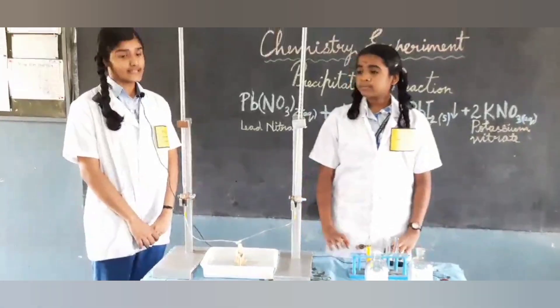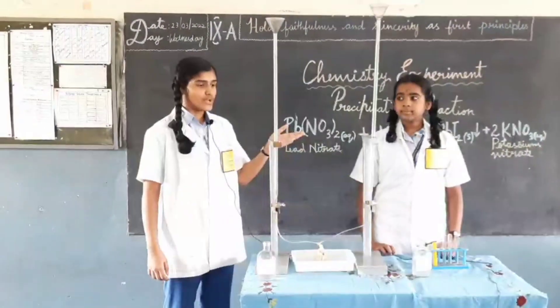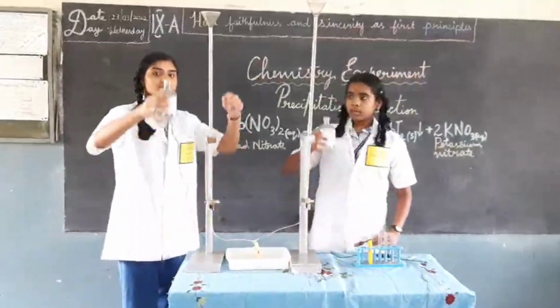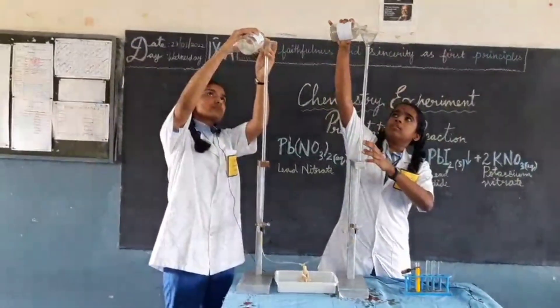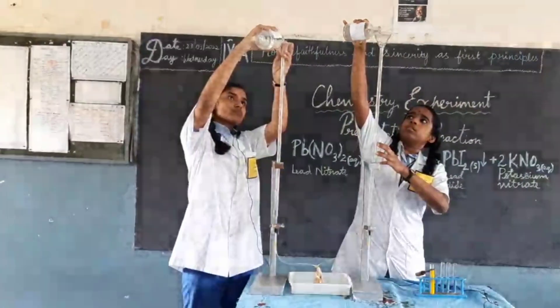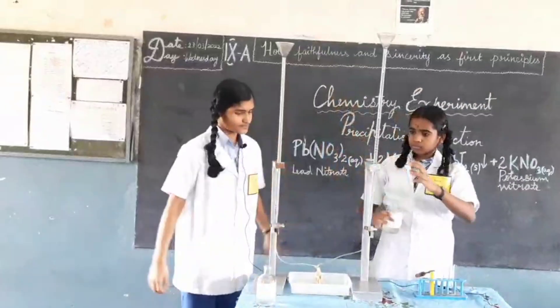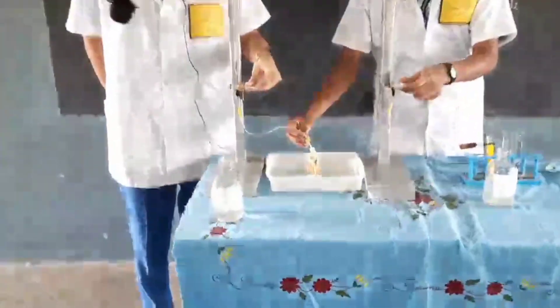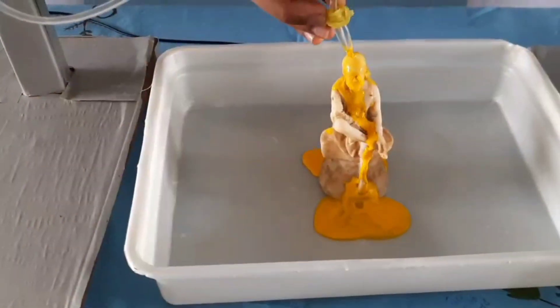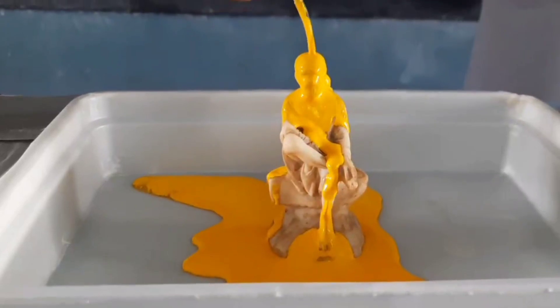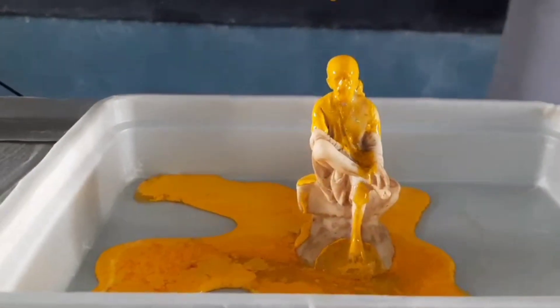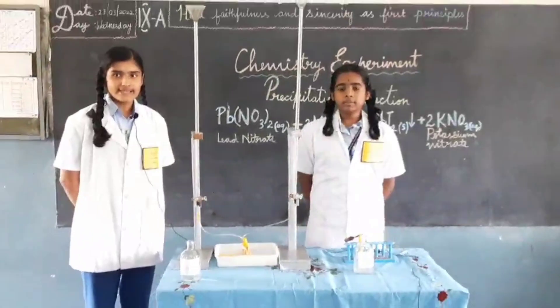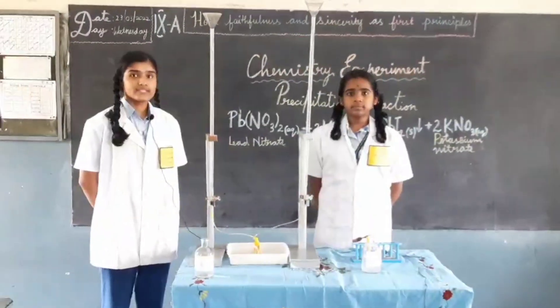Let's see the same experiment in an interesting manner. Here we have two burettes. One of them is going to be filled with lead nitrate and the other is going to be filled with potassium iodide. Both of the solutions are connected with a tube. When the solutions are allowed to mix, we get a yellow precipitate. When the aqueous solution of potassium iodide and lead nitrate are mixed together, a double displacement reaction takes place.